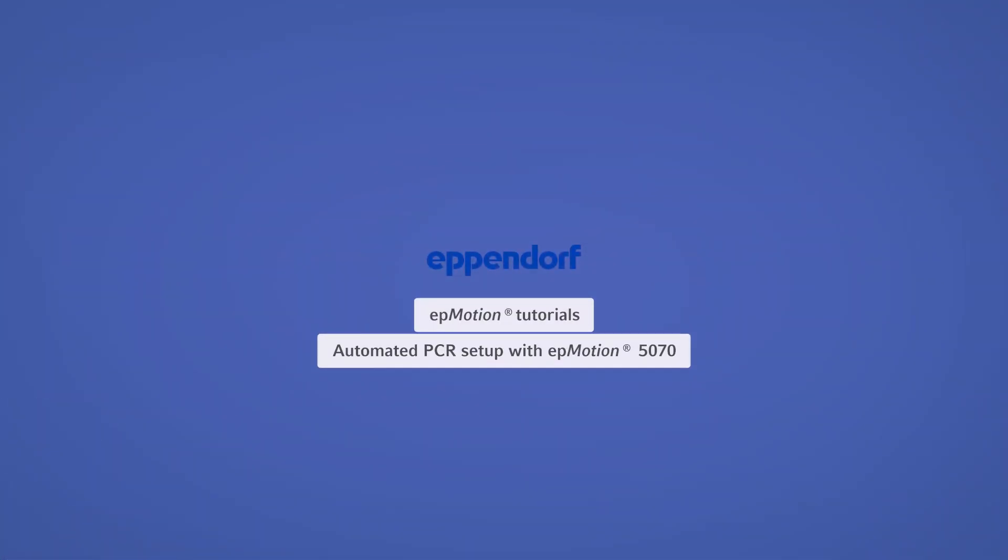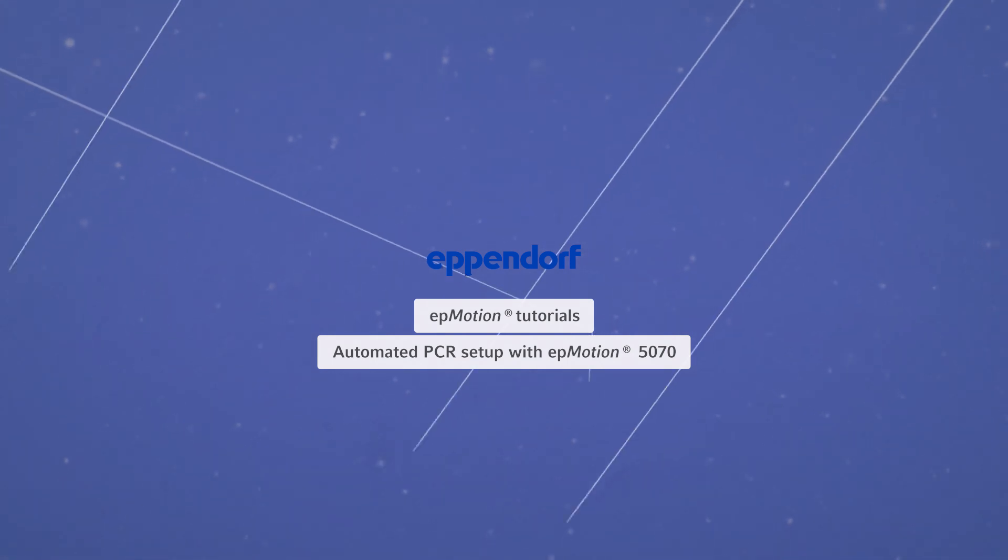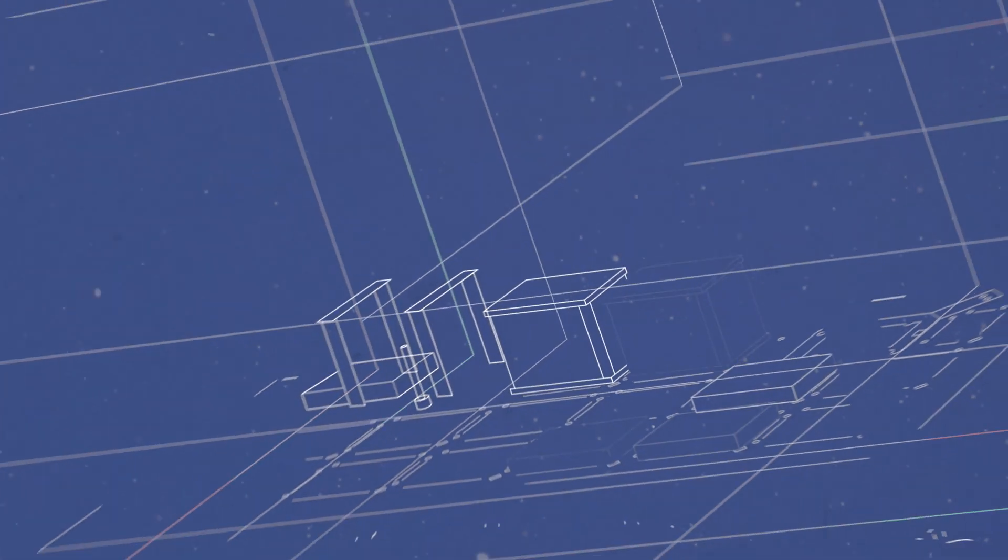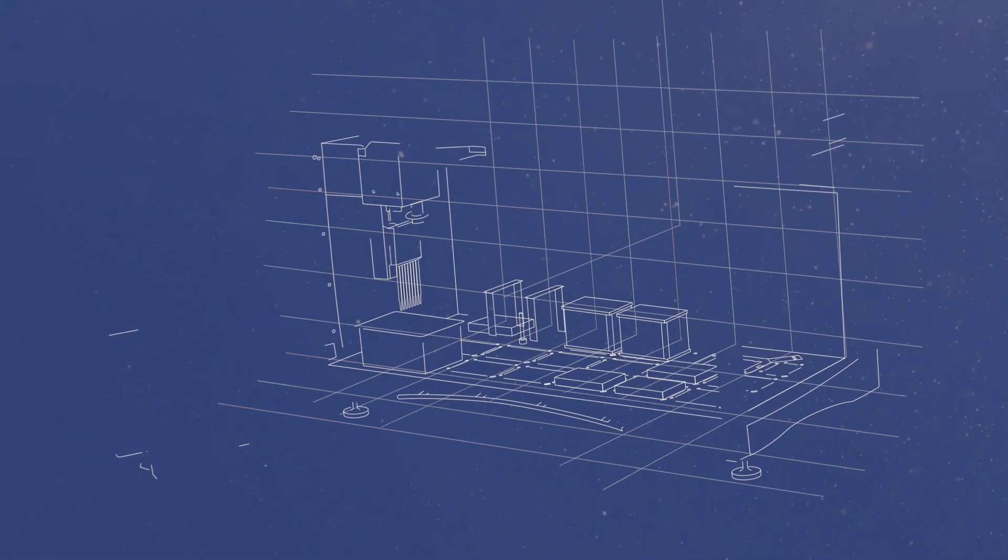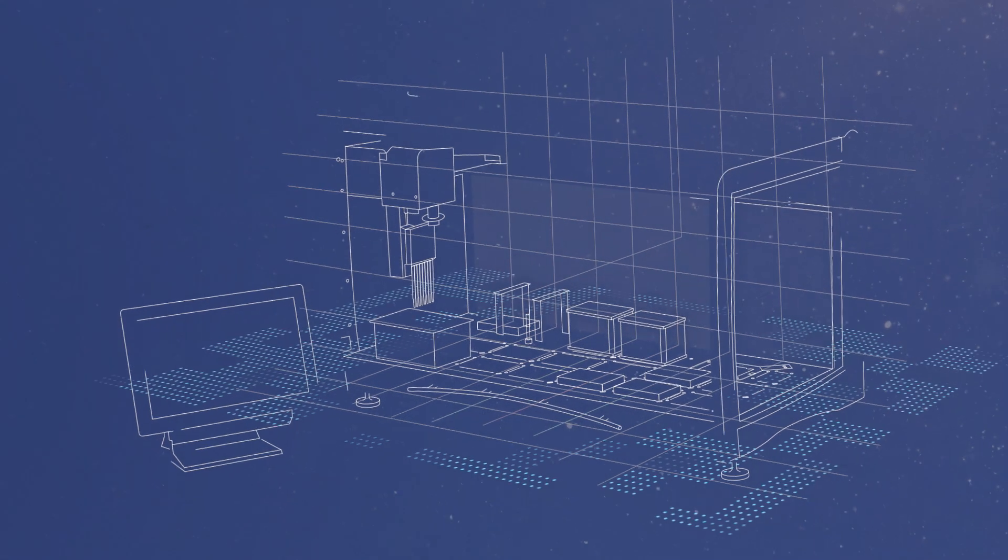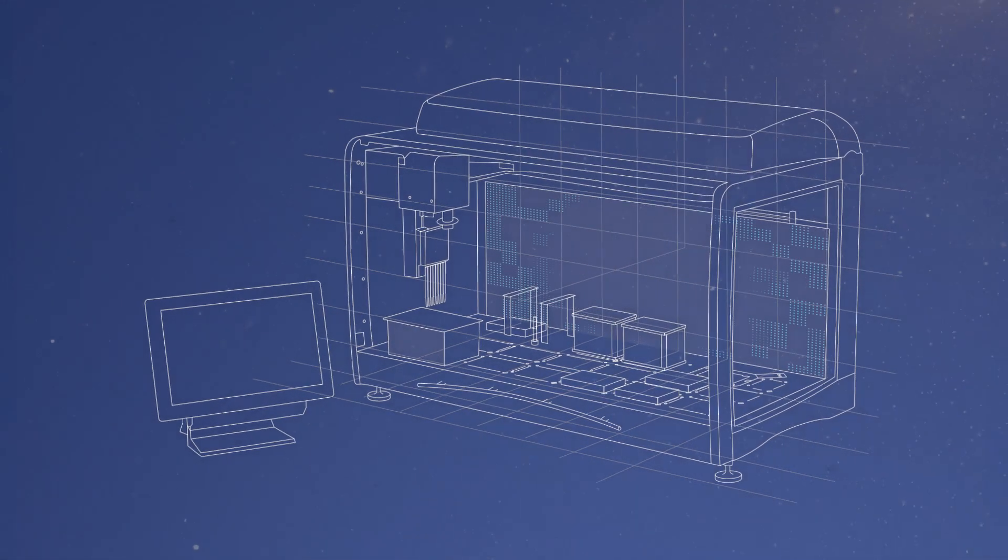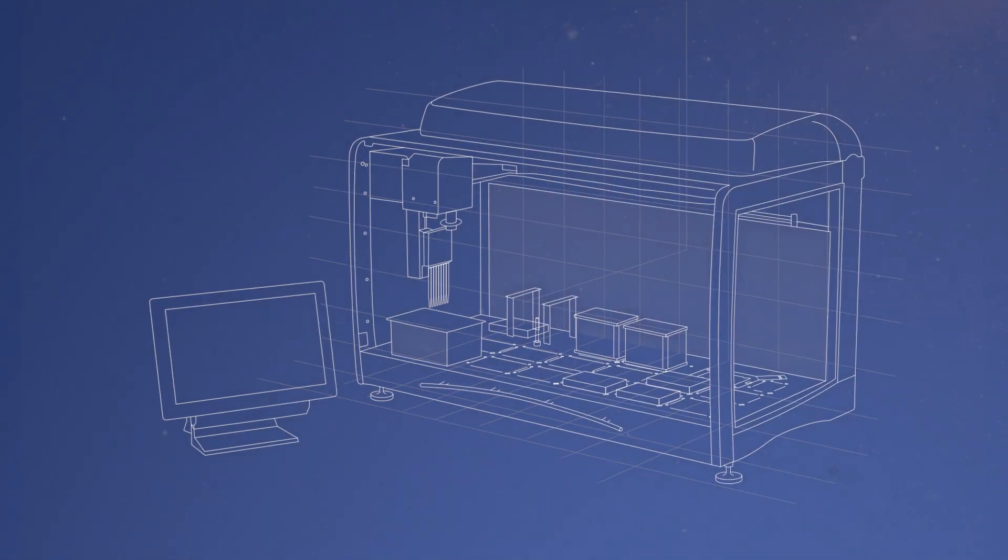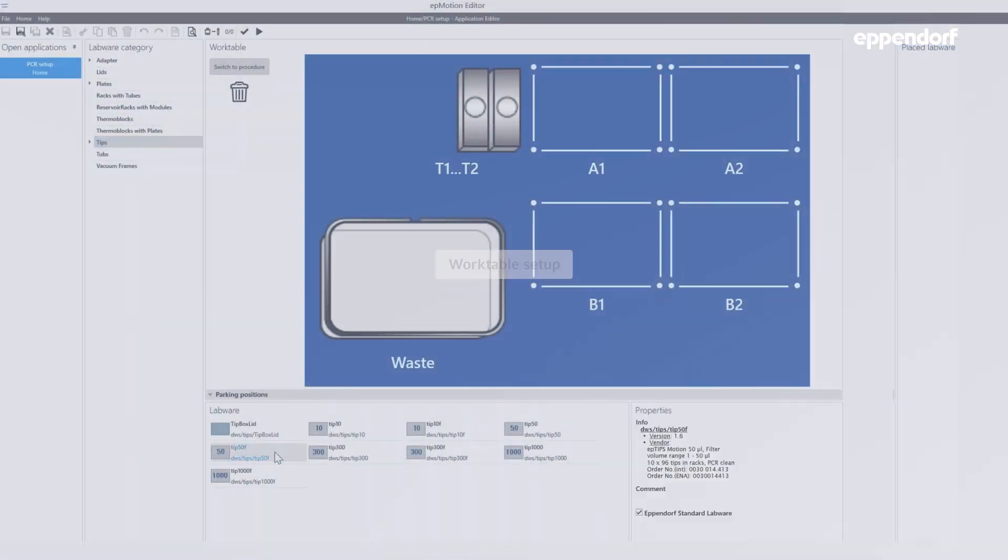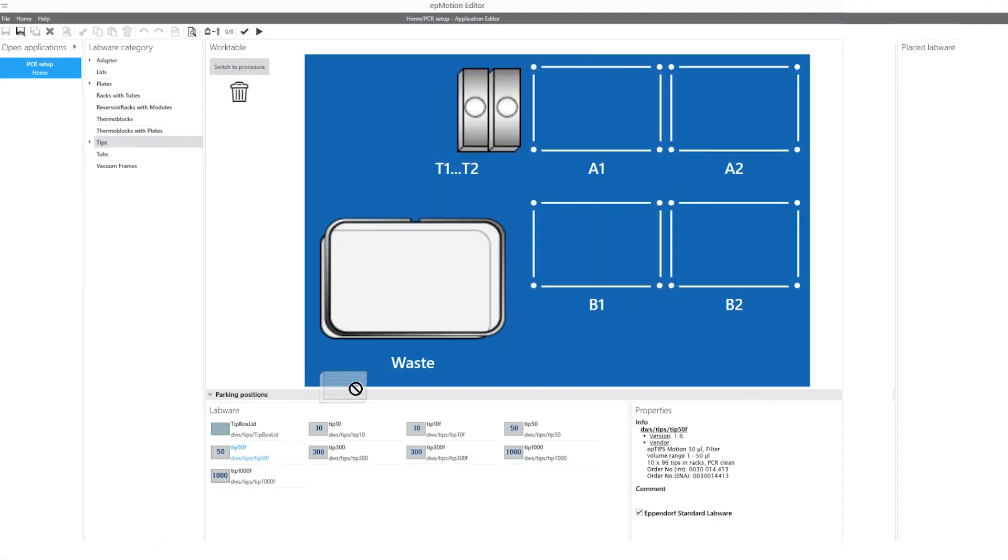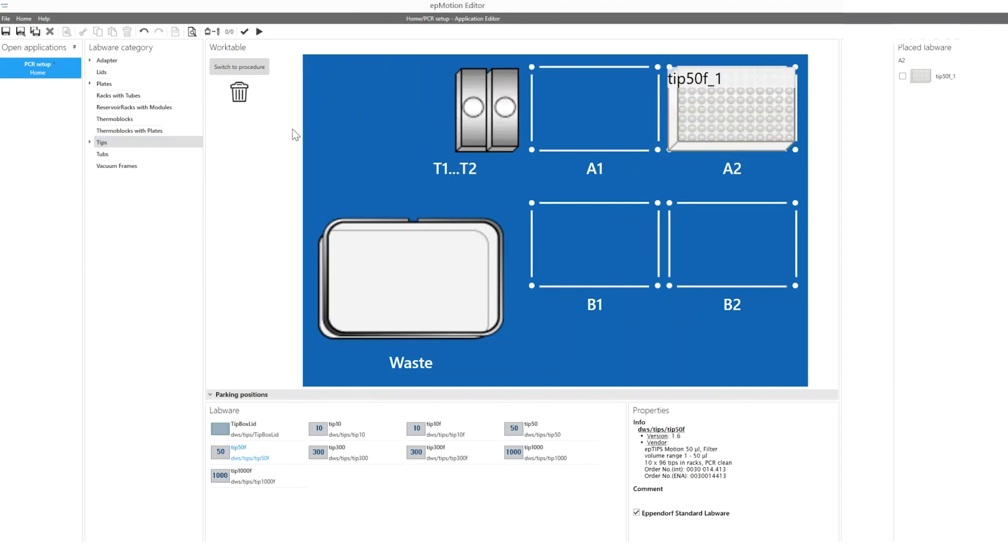Welcome to the EPMotion tutorial automated PCR setup with the EPMotion 5070. The EPMotion 5070 has four deck positions and is the most compact EPMotion for PCR setup.